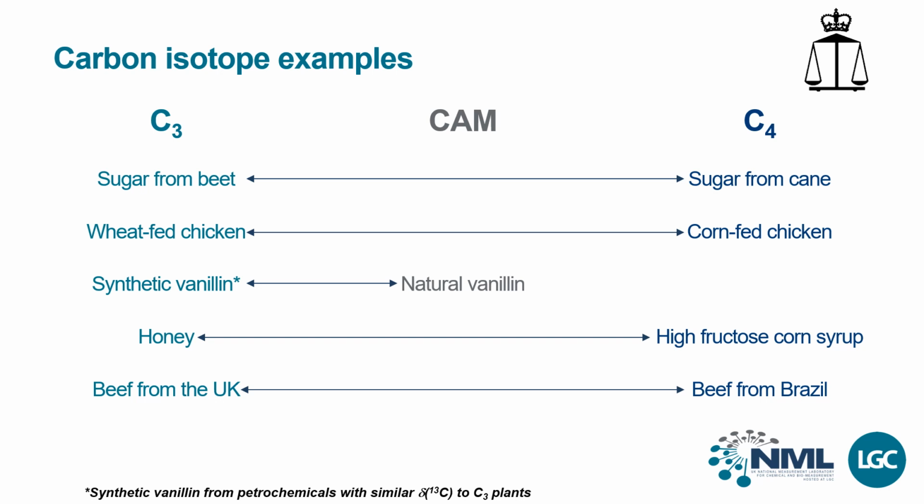In some instances, carbon isotopes may be used to uncover adulteration of foods. The classic example is adulteration of C3 honeys with C4 high fructose corn syrup. This technique is made powerful by comparison of the honey-sugar carbon isotope ratios to the same carbon isotope ratio within the protein fraction extracted from the honey.